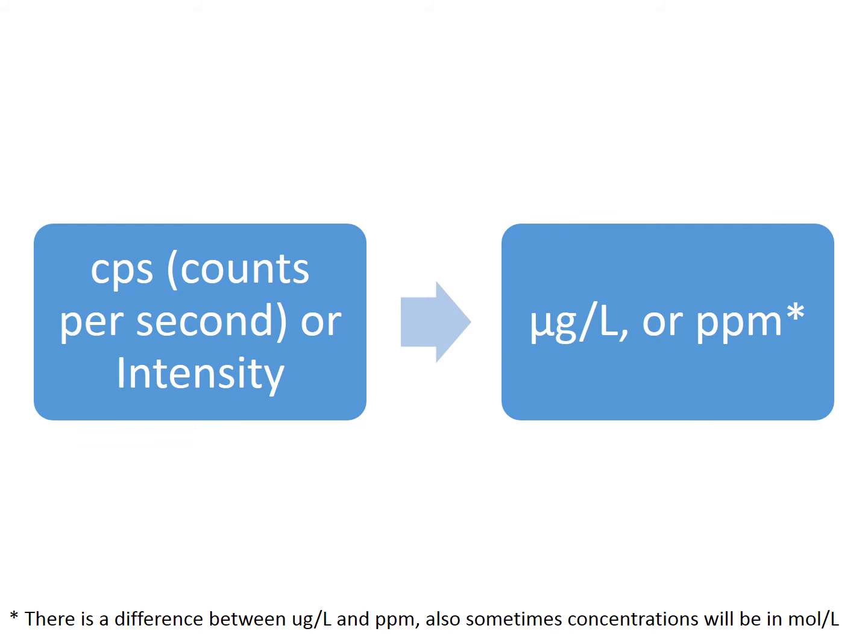But what if your solution isn't water? What if it's seawater that's a different density? Converting between units that are mass per volume and mass per mass, or moles per mole, or moles per litre, or moles per gram is a nightmare.